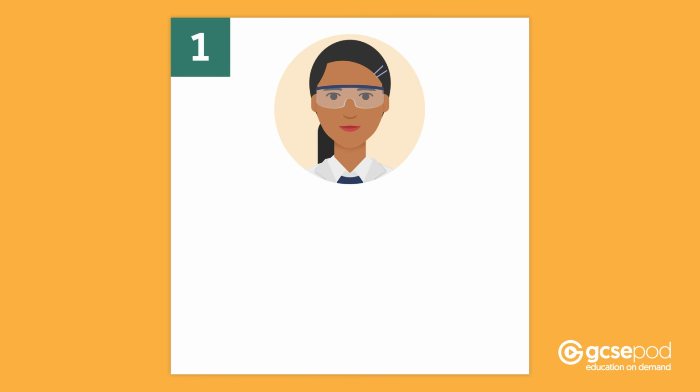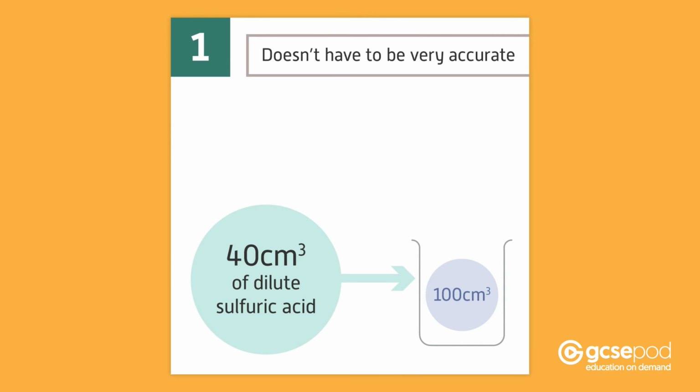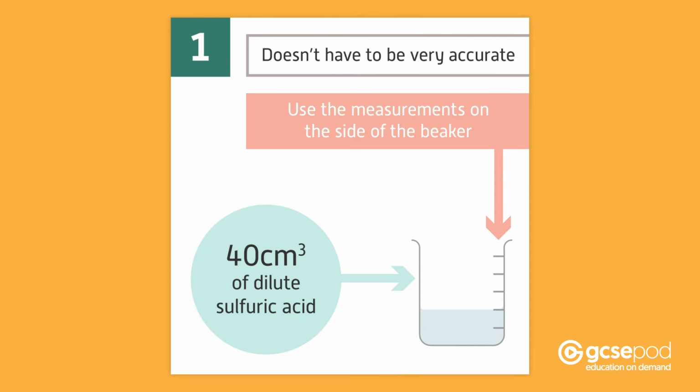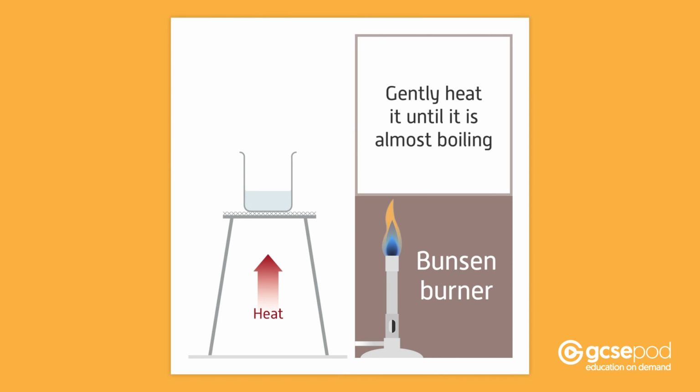Step 1. Put on the eye protection and measure out 40 cubic centimetres of dilute sulfuric acid into a 100 cubic centimetre beaker. The volume does not have to be very accurate, so you can just use the measurements on the side of the beaker. To increase the solubility of the copper sulfate so more will be dissolved in the solution, you need to heat the acid using a Bunsen burner. Do not boil the acid, just gently heat it until it is almost boiling. You can use a thermometer to judge when to stop heating.